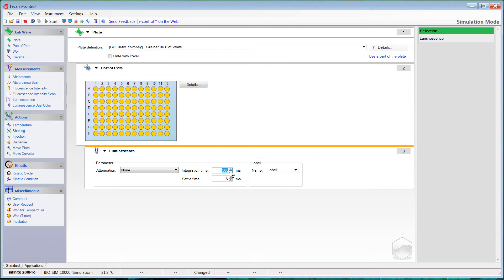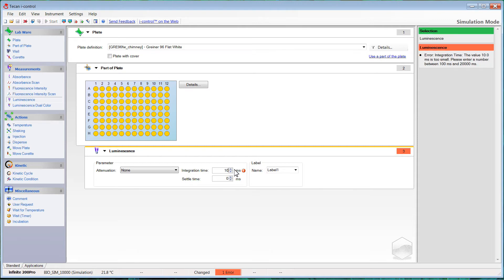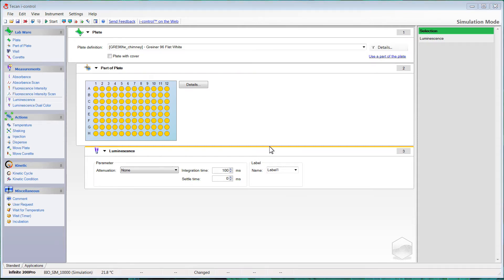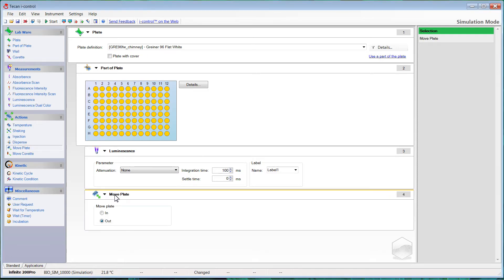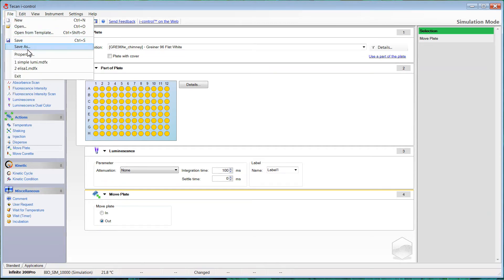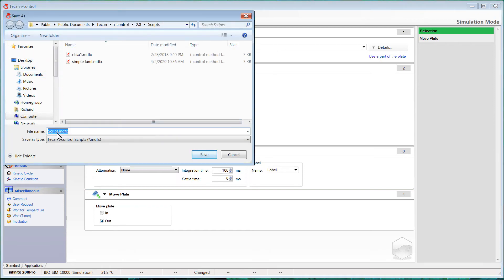If your counts are lower than that, then some additional integration time may be necessary. In extreme cases where signals are below 5,000 counts, you may need to integrate for as much as a few seconds, but generally most applications and kits will see signals in excess of 10,000 to 100,000 counts. For this example I'll put in a 100 millisecond integration time. You may also add a move-plate-out step so the plate ejects when the measurement is done, and you can go to File > Save As to give your method a name for future use.